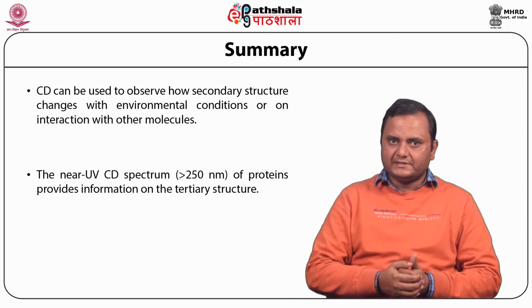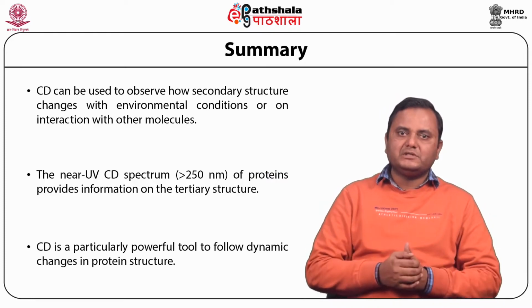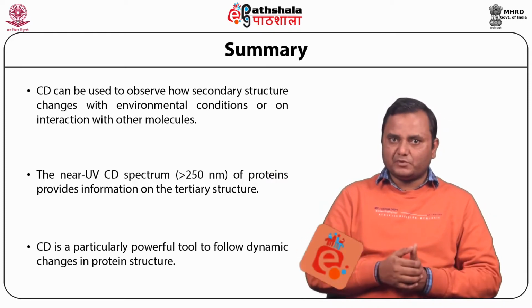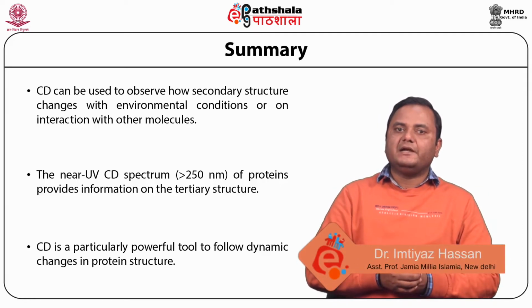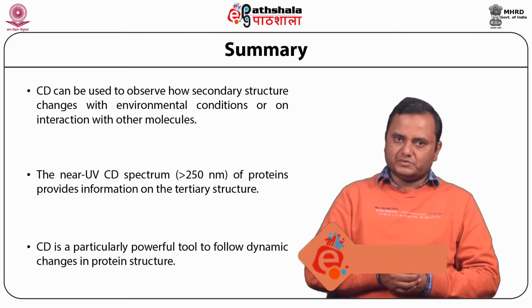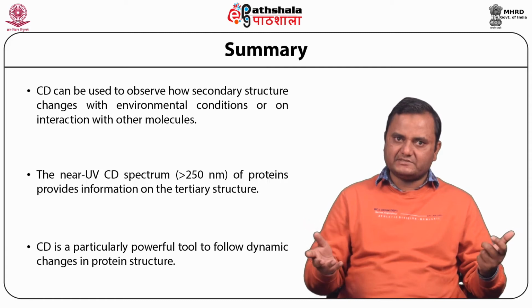Finally, CD is a particularly powerful tool to follow the dynamic changes in protein structure, which requires a very low amount of protein and gives you a lot of useful information about the protein structure, conformation and dynamics. Thank you very much.